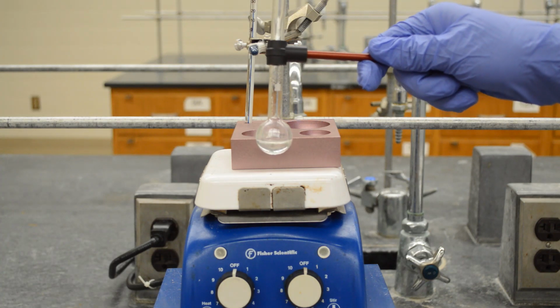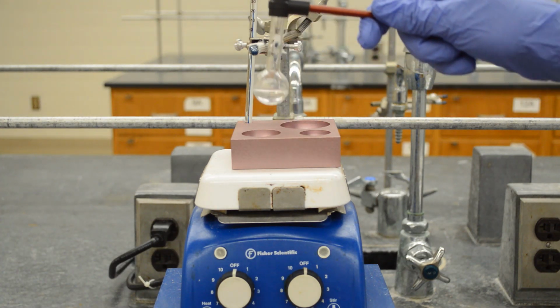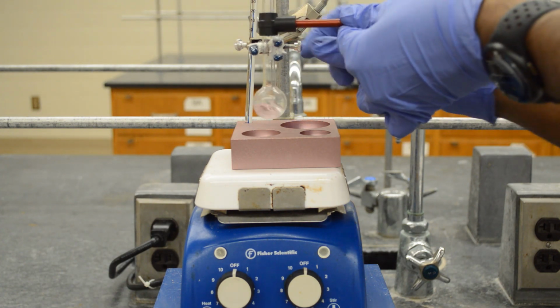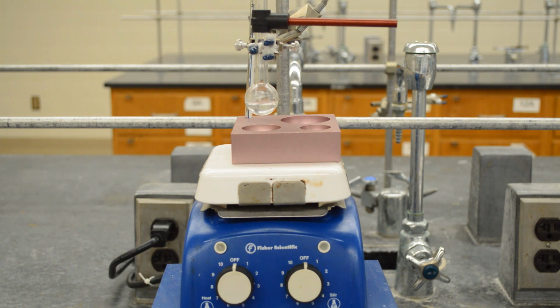Here's a reaction flask. We're going to boil this reaction mixture. So let's put an air condenser and clamp the apparatus. Raise the hot plate.